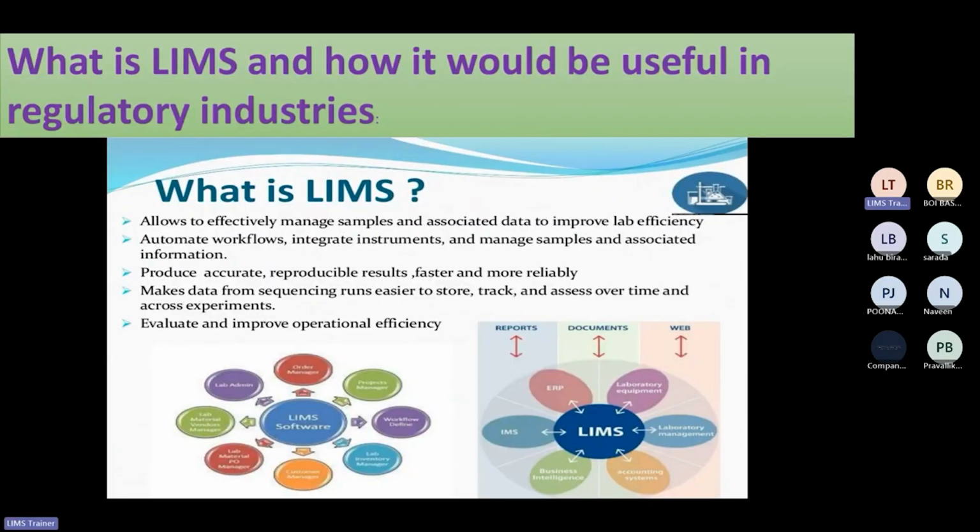Now, what is LIMS? Basically it allows you to effectively manage the samples and associated data. So basically, what does laboratory mean?